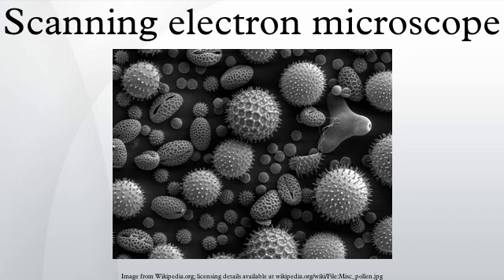Detection of backscattered electrons. Backscattered electrons consist of high-energy electrons originating in the electron beam, that are reflected or backscattered out of the specimen interaction volume by elastic scattering interactions with specimen atoms. Since heavy elements backscatter electrons more strongly than light elements, and thus appear brighter in the image, BSE are used to detect contrast between areas with different chemical compositions.